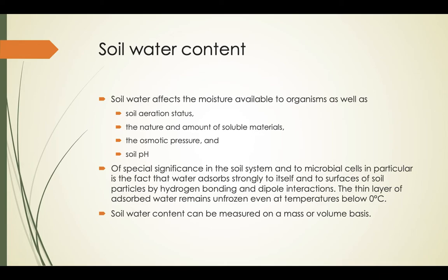Now, as a reminder, soil water content may be measured on a mass or volume basis. So we can measure soil water content via mass or via the volume component, or via the volume unit.